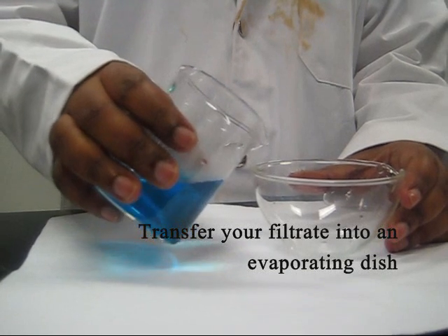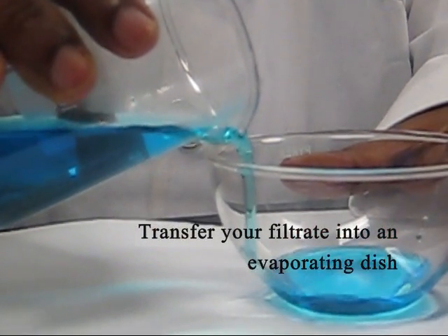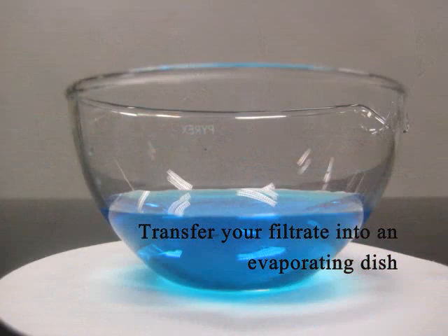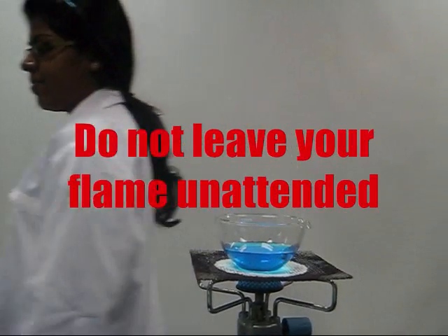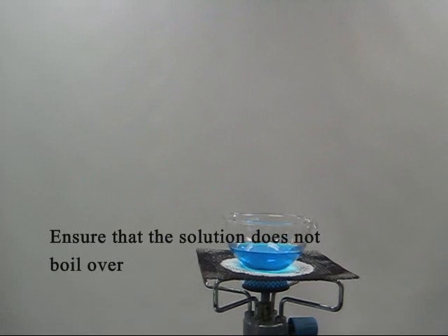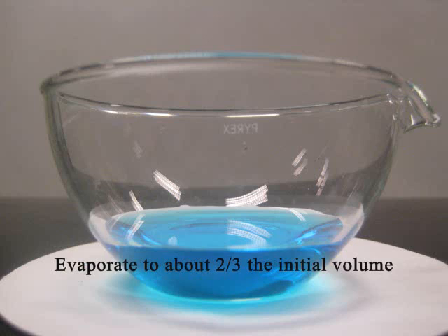Do not use a beaker or conical flask when evaporating the copper(II) sulfate solution. For safety reasons, you must not leave your flame unattended. Also ensure that your solution does not boil over. Evaporate to two-thirds of the initial volume of filtrate.